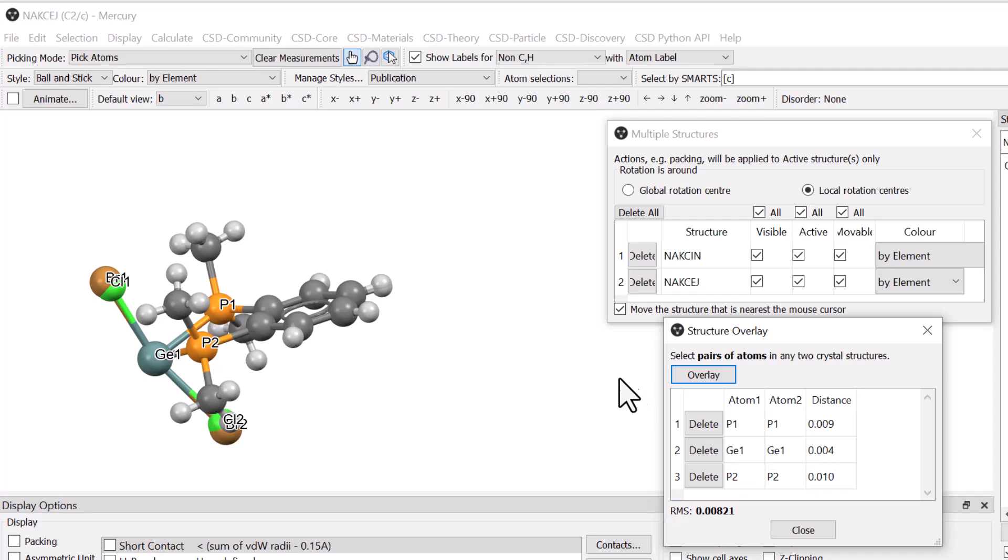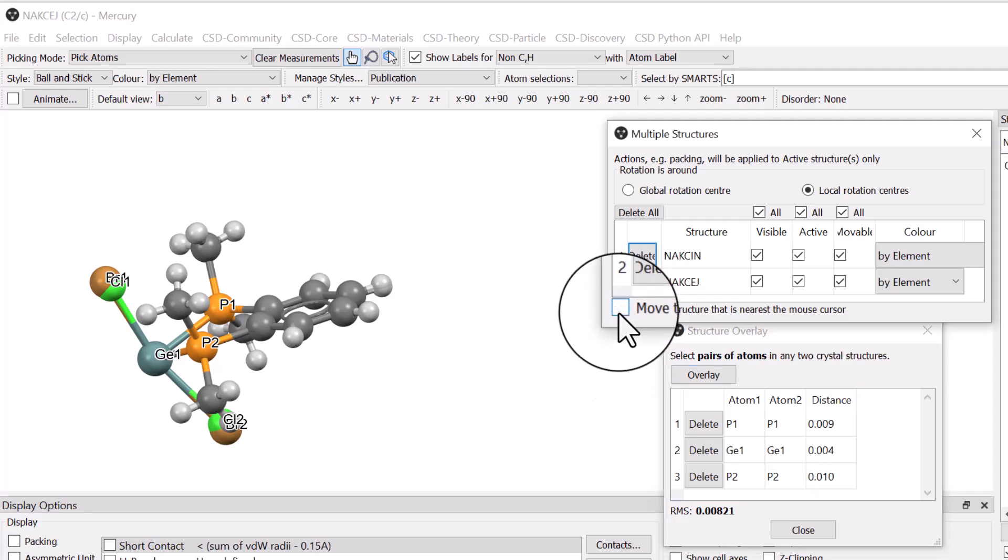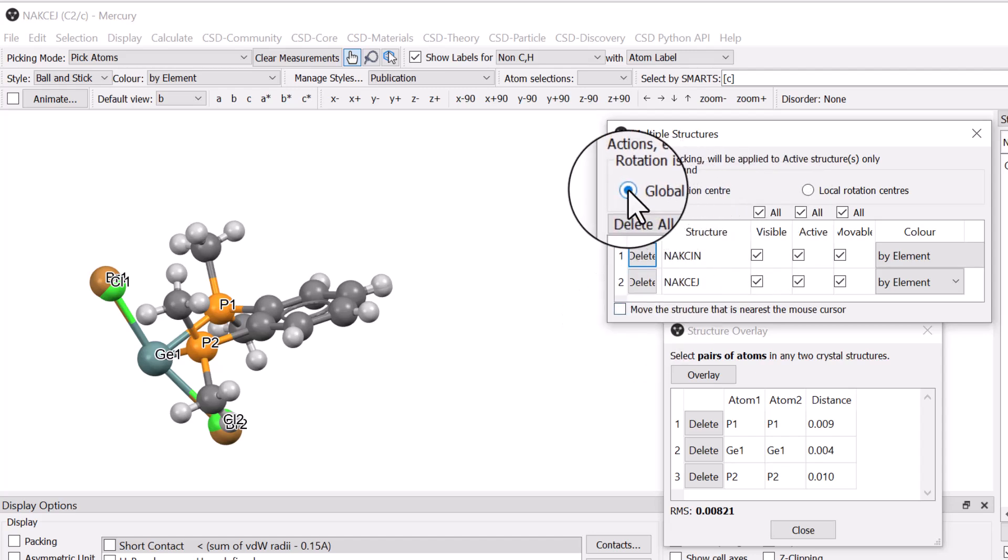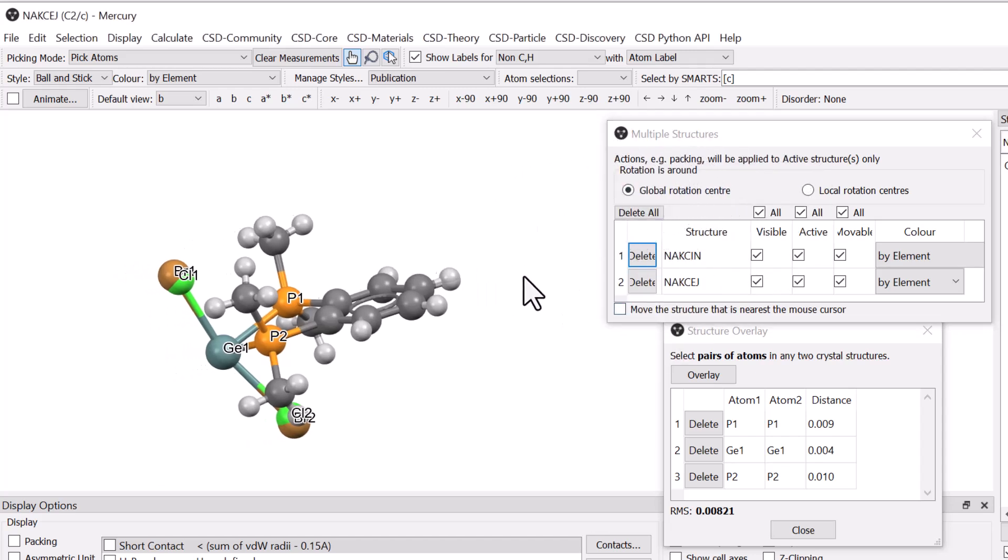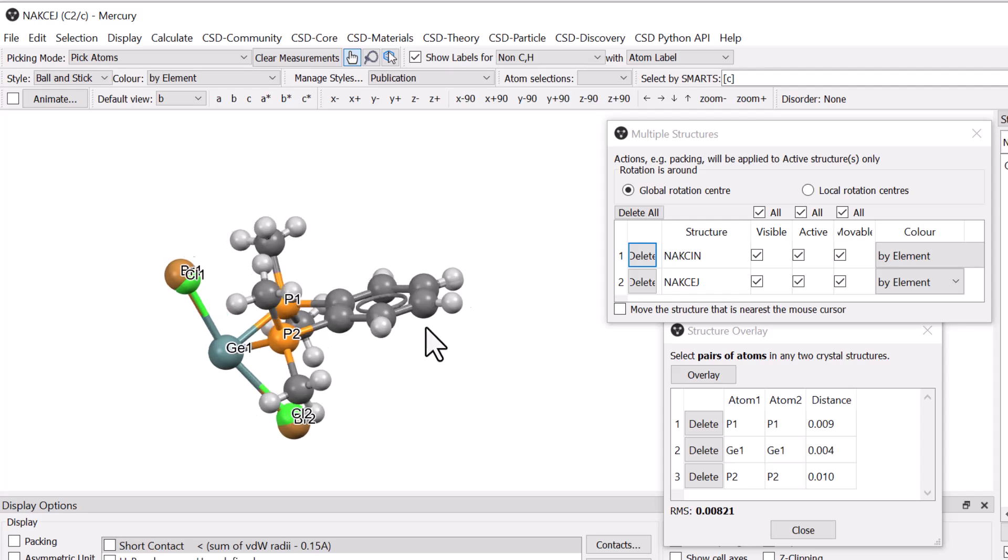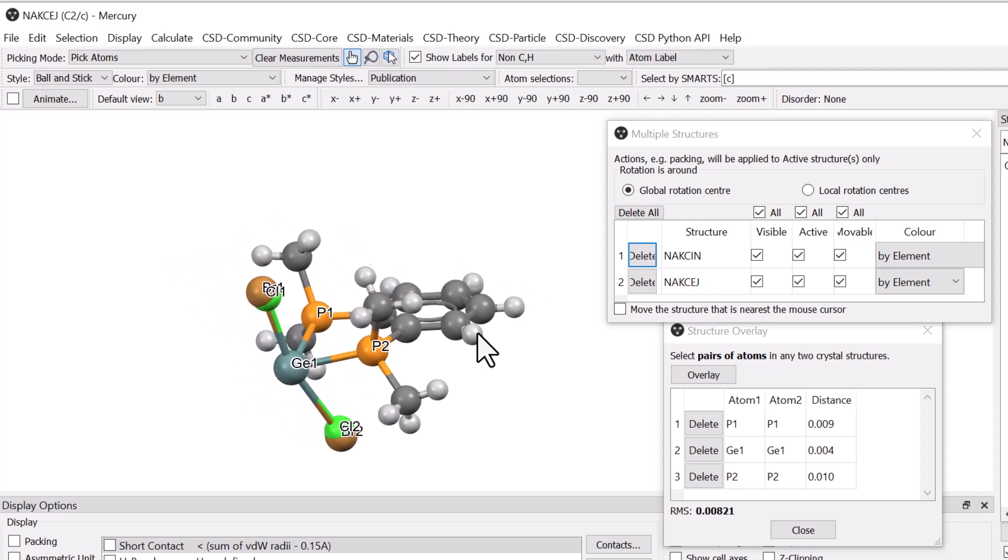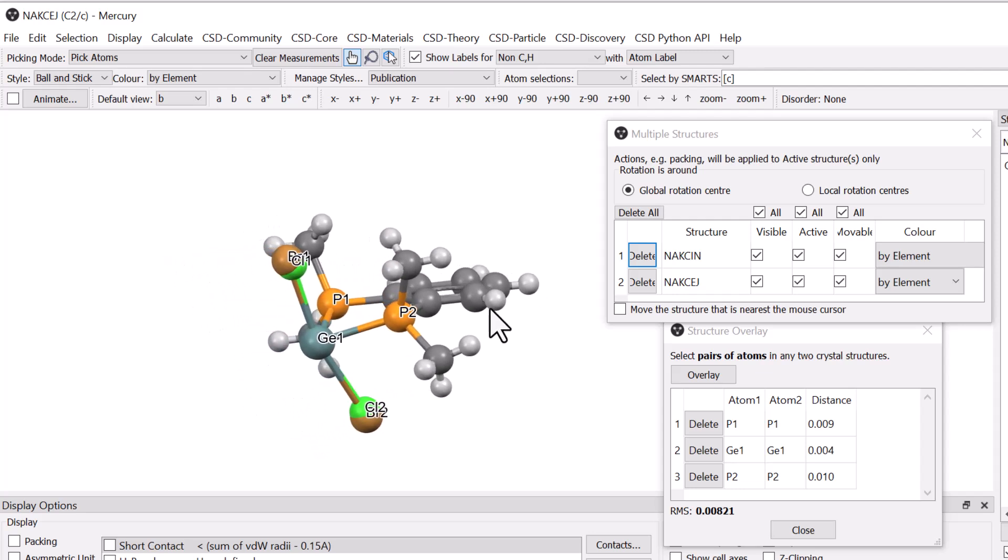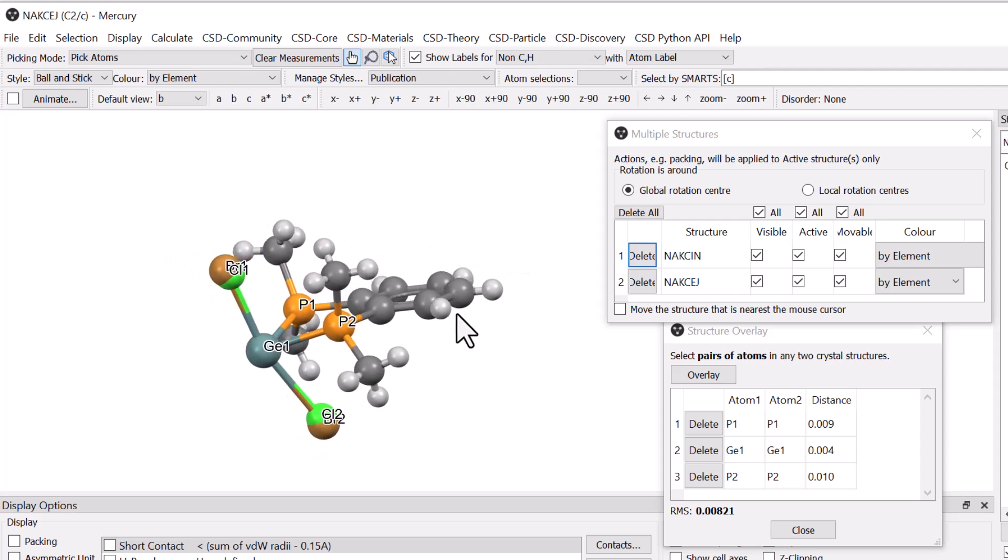In the Multiple Structures window, unticking Move the Structure that is nearest the mouse cursor, and selecting Global Rotation Centres allows you to move the structures without disrupting the overlay. You can see that it is only the differences in the germanium to halogen distances and angles that are significant.